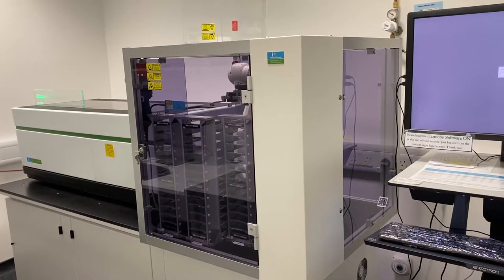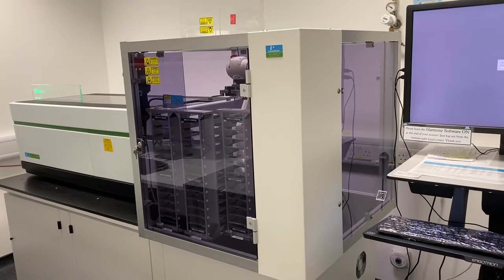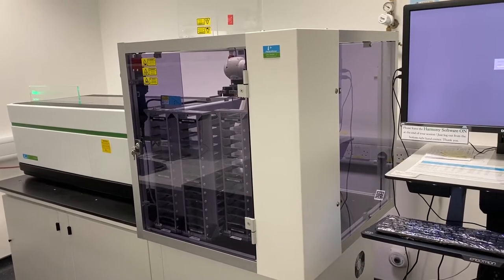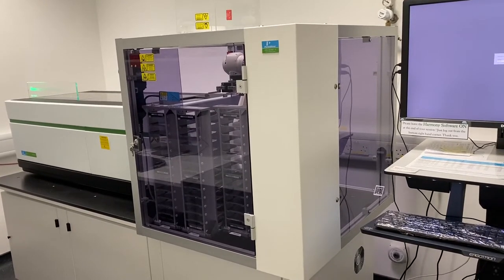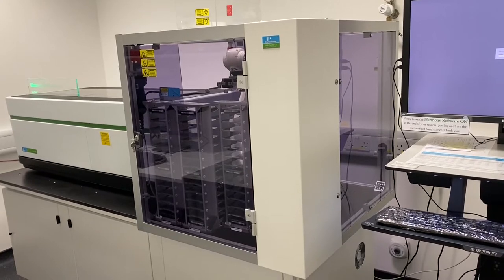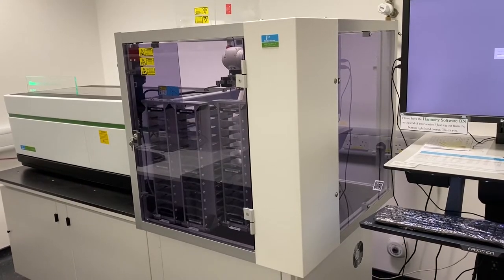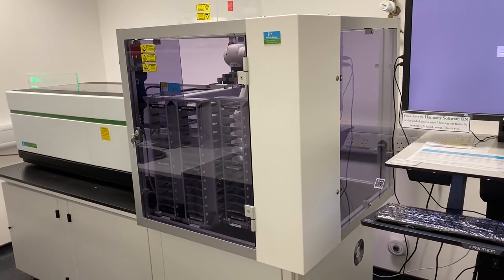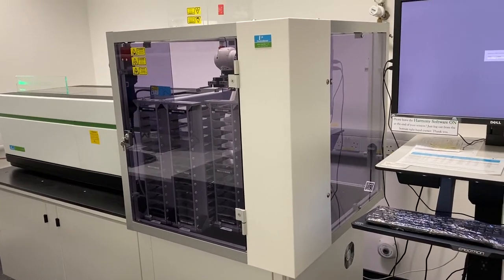Hi, my name is Chen. I'll be training you on the Opera Phoenix machine today. Step one is how to switch on the system. When you come into the Opera Phoenix room, the Opera Phoenix machine and the computer should be left on by the last user.